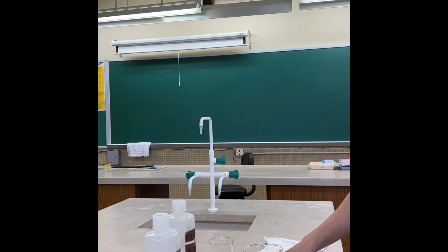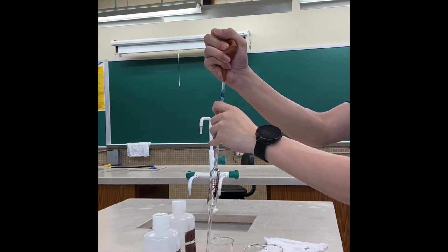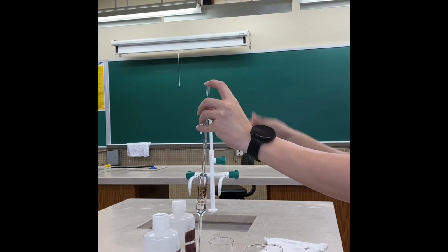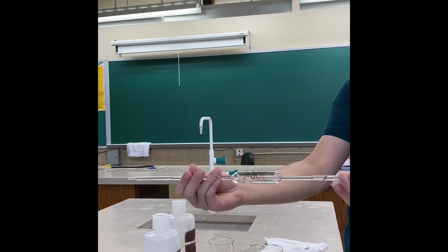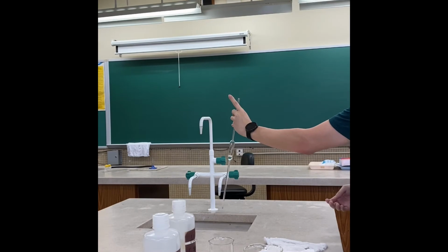And for the second pipette also, rinse it using distilled water. To remind you of the technique, you should hold it horizontally and rotate it, and then release all the water inside.